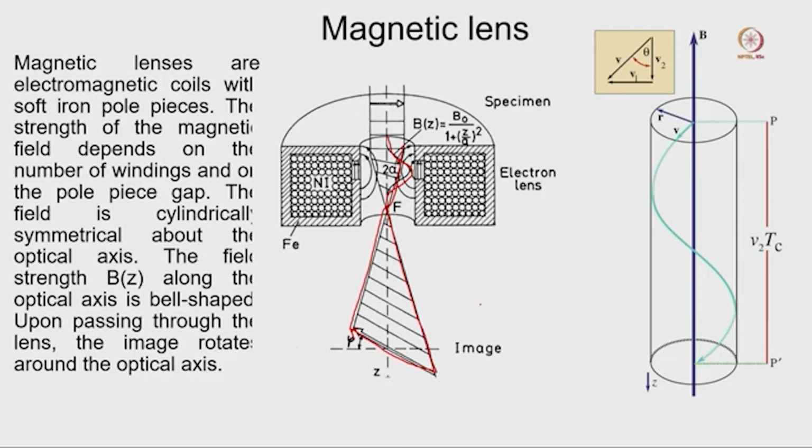So if you remember our light microscopy, if you just consider any glass lens, what are we getting? If this is a glass lens and we have an object at 2f distance or in between f and 2f distance, rays will come here, and one will go through the center and it will form an image always like that, right? So we are always saying that if my object is in between f and 2f distance, it will form a real and inverted image.